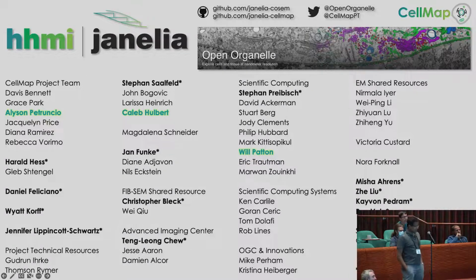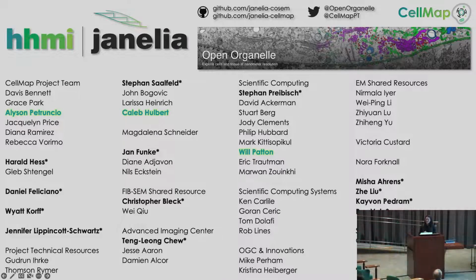When you were exploring that HeLa cell, did you discover any new organelles? So the type of machine learning we were doing was not unsupervised, right? It was supervised, so no. But as we personally go through the data and generate all this training data, there are a lot of opportunities to find things that you didn't realize or expect. Perhaps not well classified by the algorithm.